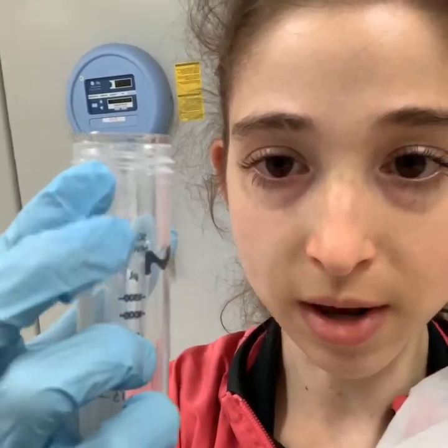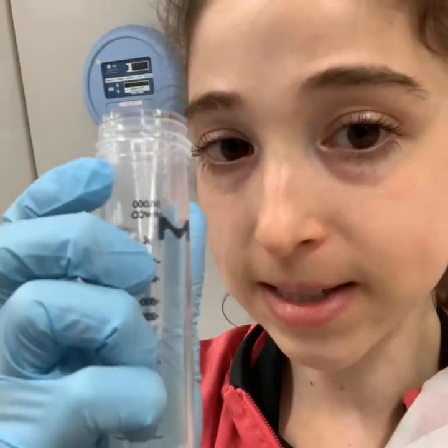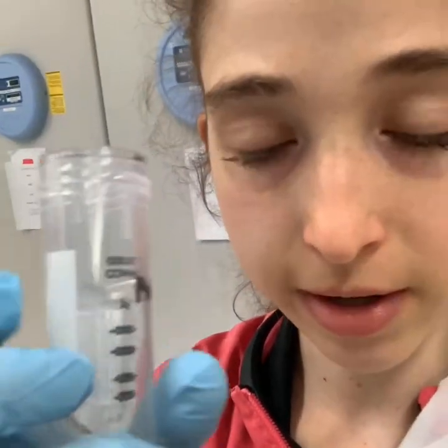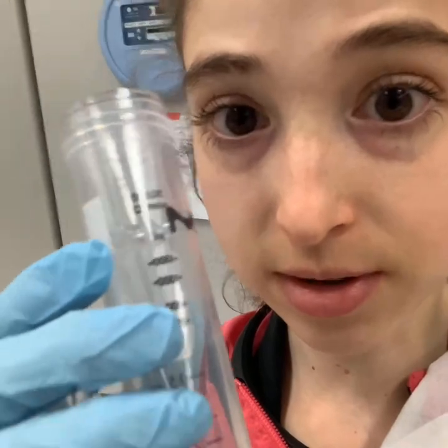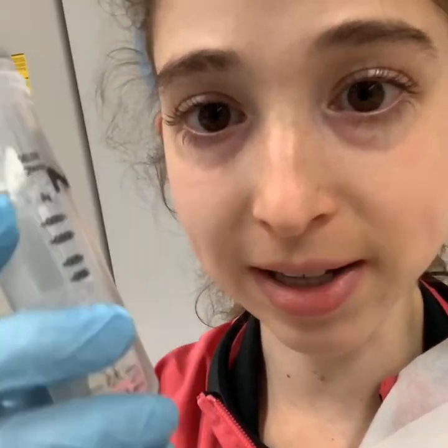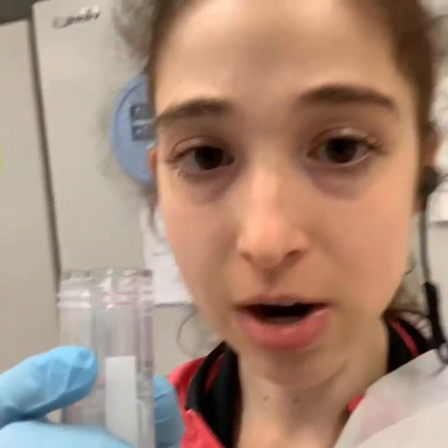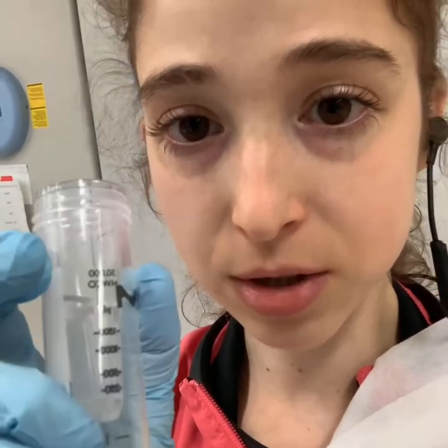With these bigger ones, you can watch from the outside what the protein volume remaining is. These have a dead stop volume — it'll depend on the size of the concentrator — but it won't concentrate further than that smallest volume. So you don't have to worry about drying it out and having everything go through. But if your protein gets too concentrated, it might crash out — aggregate and clump up — and you don't want that.